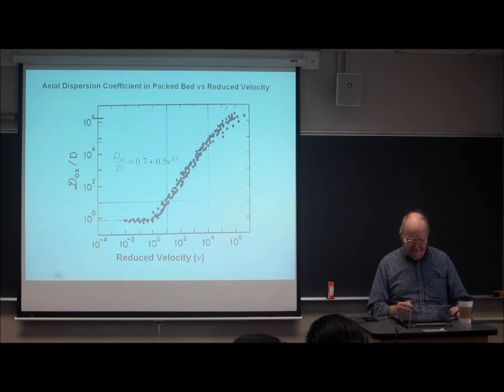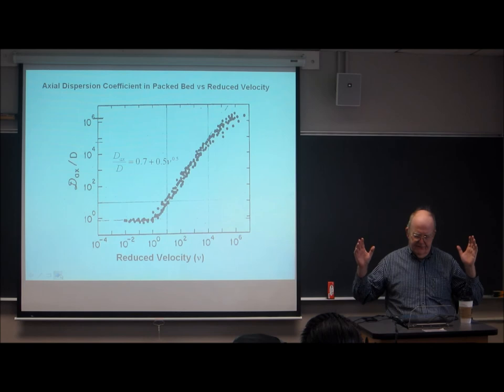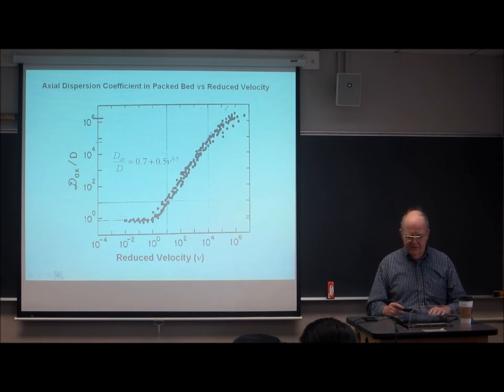Now, our friends, the chemical engineers, don't do things the same way analytical chemists do things. They study massive systems. This is not an HPLC column. It's not a GC column. This is pipes packed with particles. I don't know how big the pipes were. I don't know how big the particles were. This is a bunch of experiments that they've smooshed together. It's a log-log plot, again.